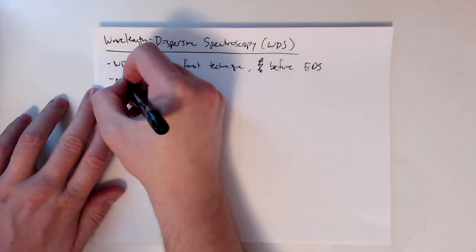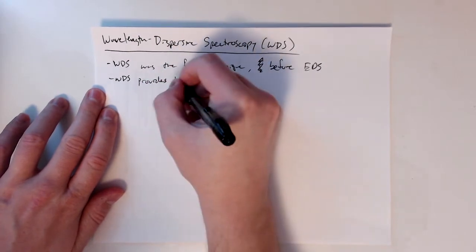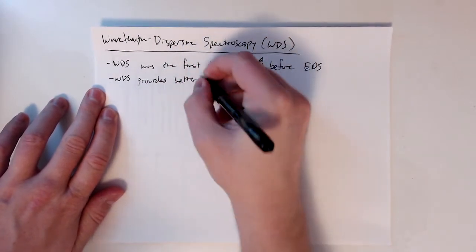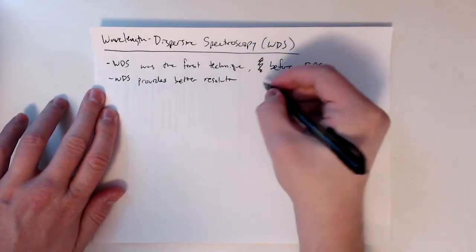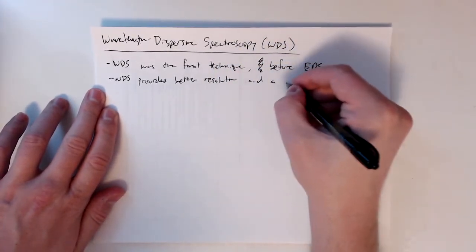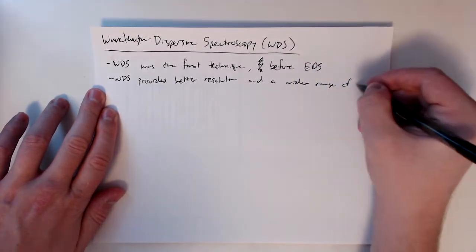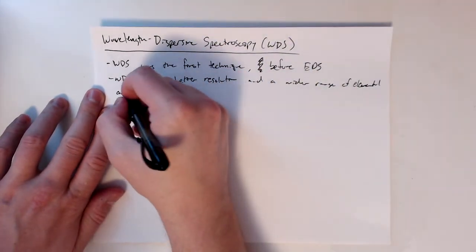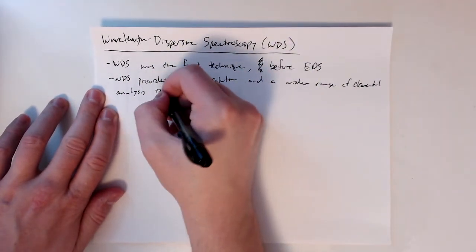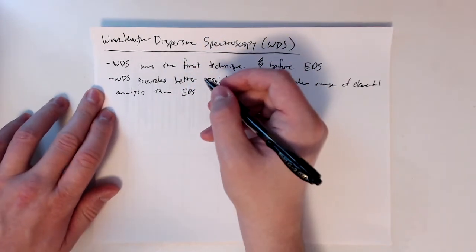WDS provides better resolution and a wider range of elemental analysis than EDS. So there's definitely some advantages here.